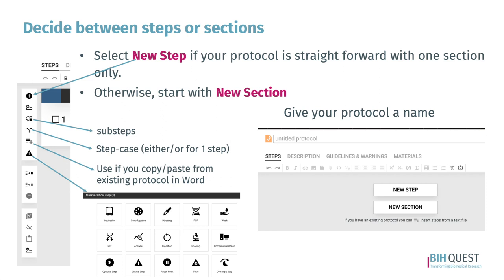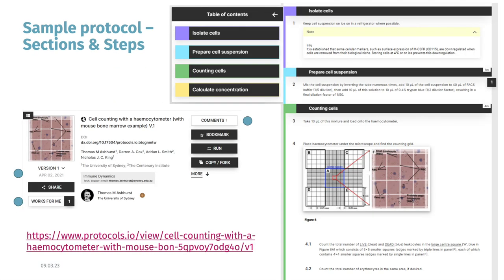Marking critical steps can be important, and there's a specific palette for this. When you look at a finished protocol you can see the nice color coding, where different sections have different color codes — to me at least it makes it more appealing to use and gives a nice overview. On the left you can also give your protocol a small thumbnail image so it's more easily recognizable.